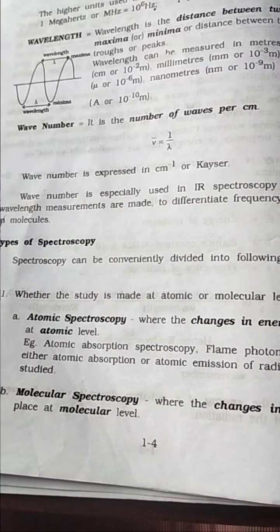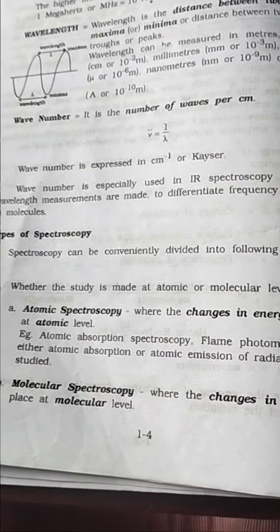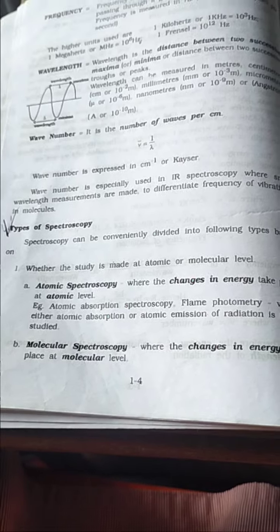Here the main topic is the types of spectroscopy. Spectroscopy is conveniently divided into the following types: atomic spectroscopy, molecular spectroscopy, absorption spectroscopy, emission spectroscopy, electronic spectroscopy, magnetic spectroscopy.